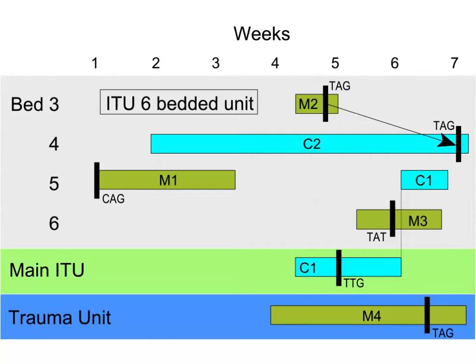Actually, although M2 and M4 didn't come across each other in a hospital, when digging back into the records, they were repatriated at the same time through the same pathways, and so it's likely that either one gave it to the other during that repatriation, or they caught it from the same common source along the way. So there was an epidemiological link there.